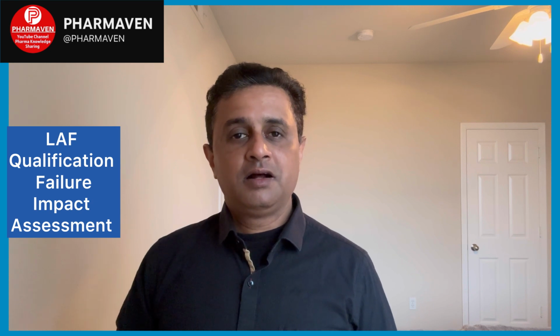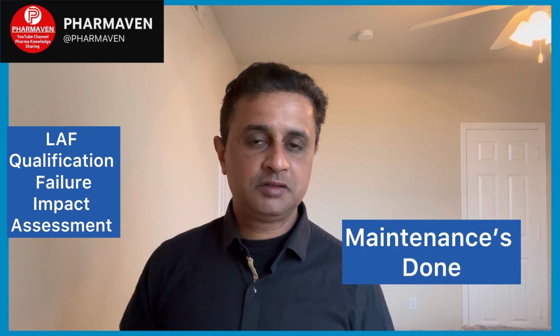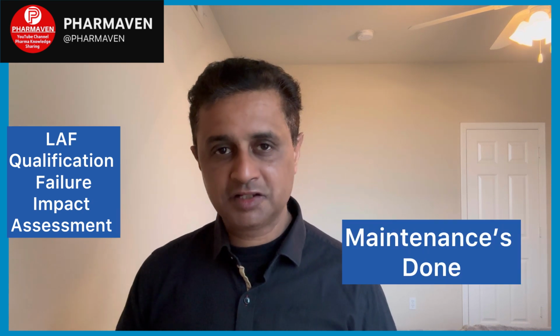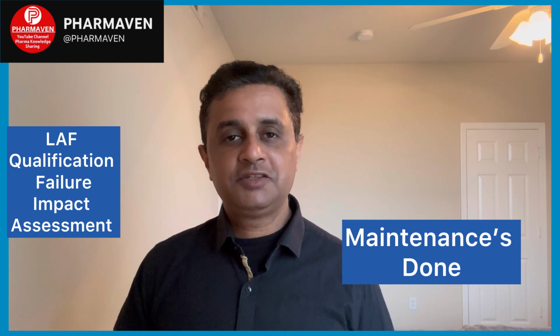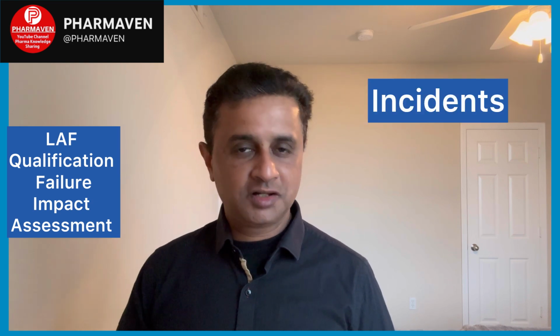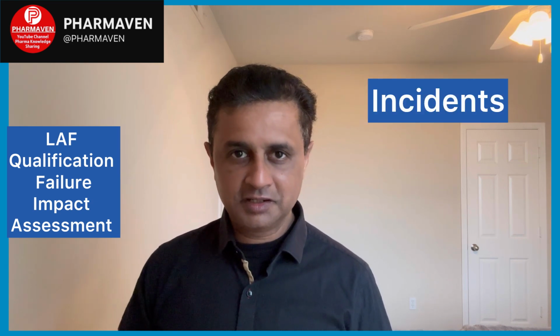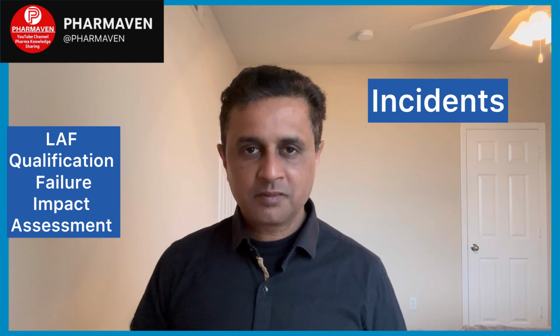Then understand the usage and the routine maintenance procedure of that LAF or filter, whether there were any changes, and whether there was any batch-related or process-related incident related to the filter which could have an impact on the integrity.